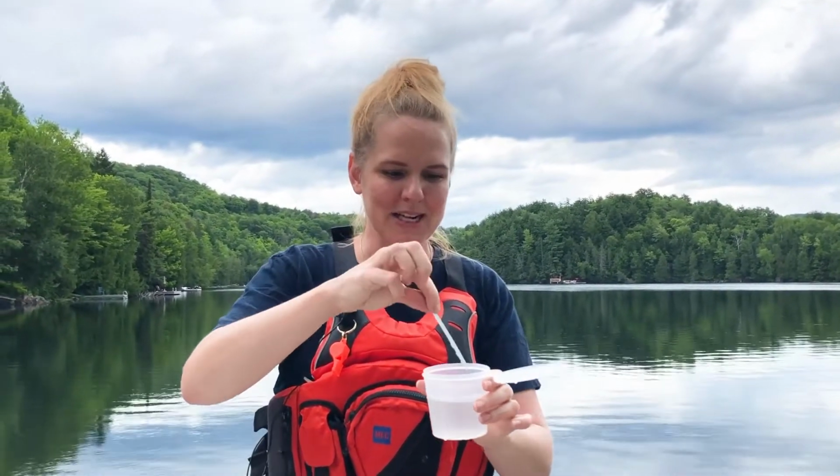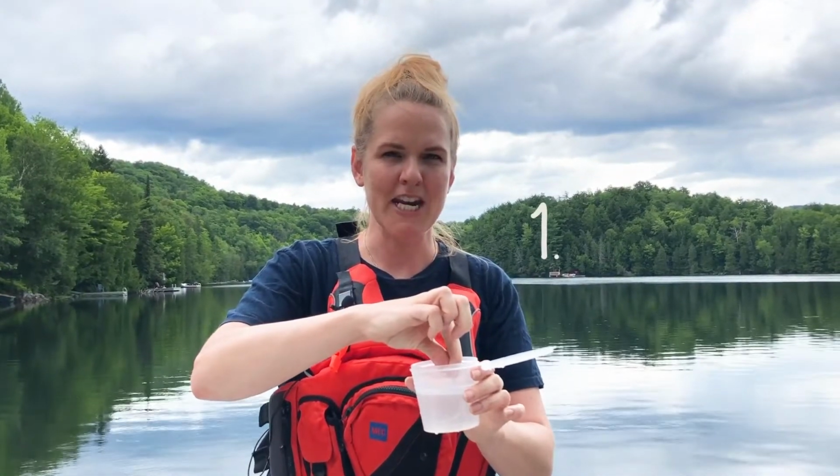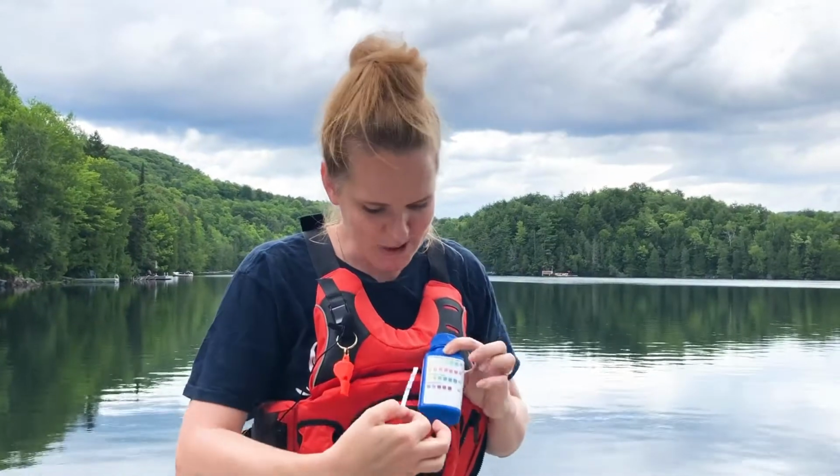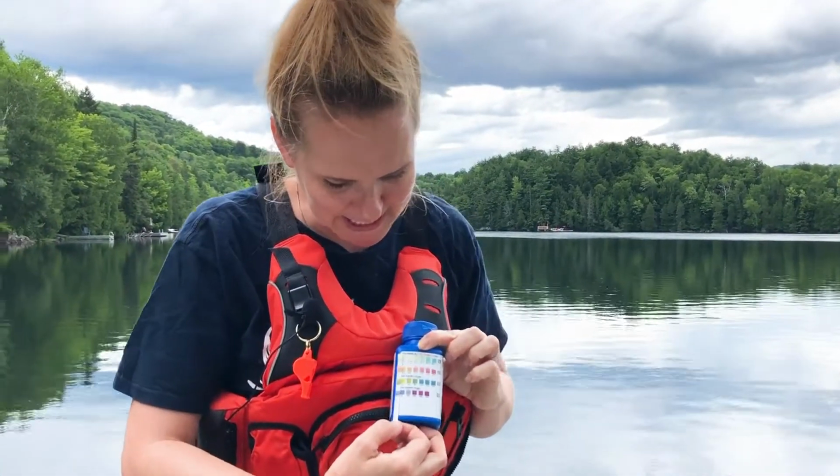This is a sample I just took from the water here. I'm going to dip it in for 2 seconds. 1, 2, and then I'm going to wait 20 seconds, after which I'm going to compare vertically like this.